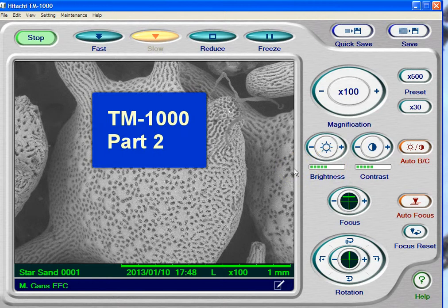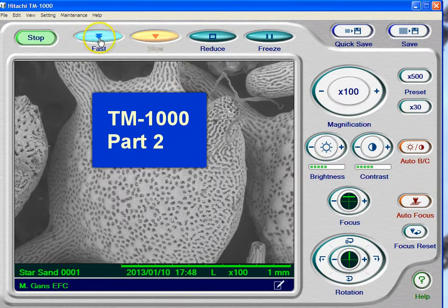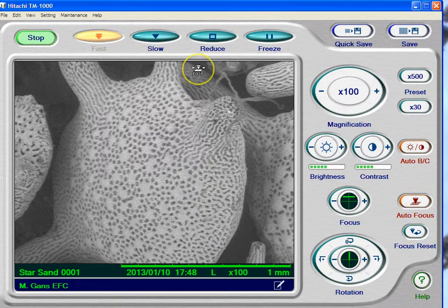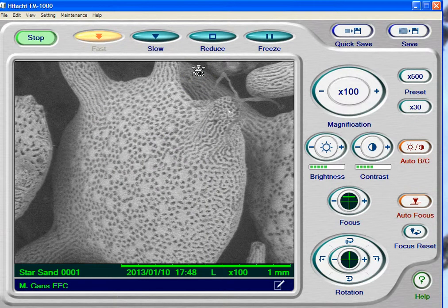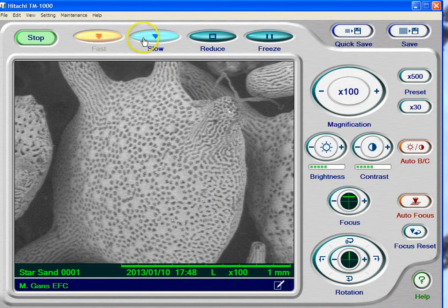So here's the question: why have a fast and slow scan? Two reasons. First of all, the fast scan — I'm going to go to fast scan here. Notice, if you will, that the quality of the fast scan is not as good as a slow scan.